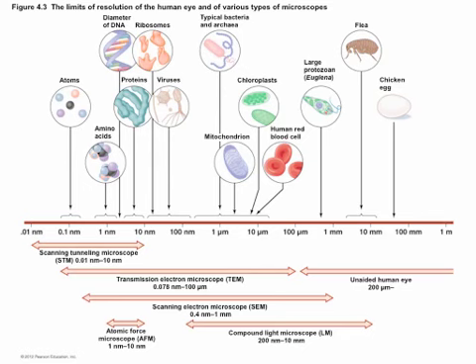I've used a dissection microscope before. Which one's that? A dissection microscope is actually not a compound light microscope. It's a single lens light microscope. It can't go quite as far as a compound light, but that's what you would use to look at things that are bigger than a centimeter. I used to look at flowers, basically plant reproductive organs, when I was doing plant breeding, through a dissection scope.